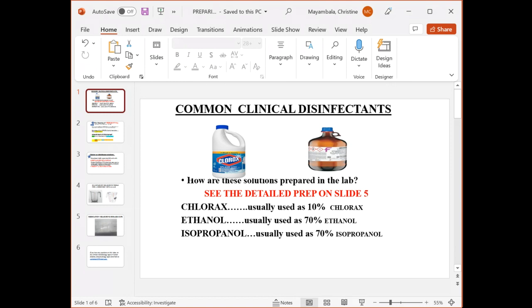By just buying concentrated bleach from Clorox, the same bleach that you use for your laundry, and you dilute it down to a concentration that is enough to kill the organisms without spending a lot of money. I have 6 slides here that I prepared that you can follow along.